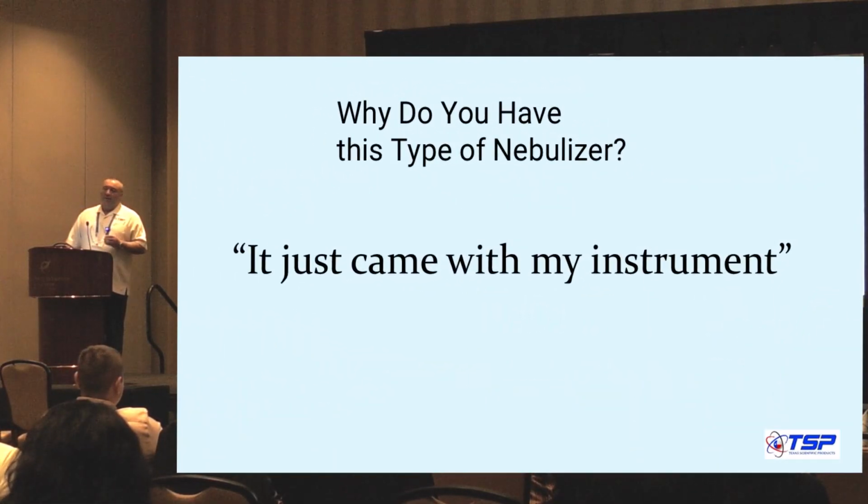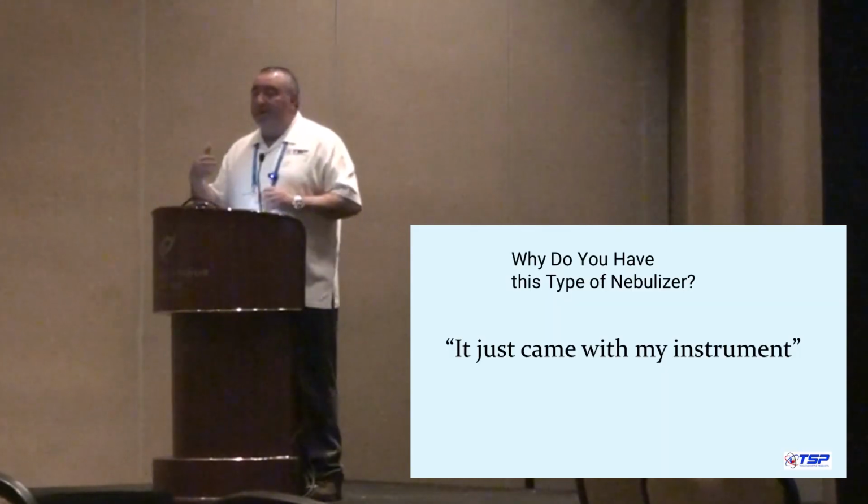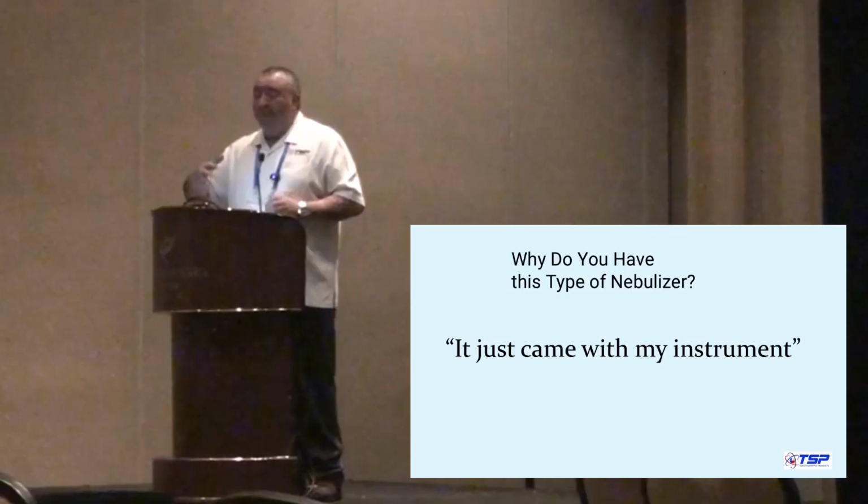When we work with you, it's asked, what type of nebulizer do you have? And most often we get, this is just what came with the instrument, right? Which, if you're lucky, could be the one, or it could be what's called the default one that your ICP manufacturer is supplying it with. So it may work, it may not.